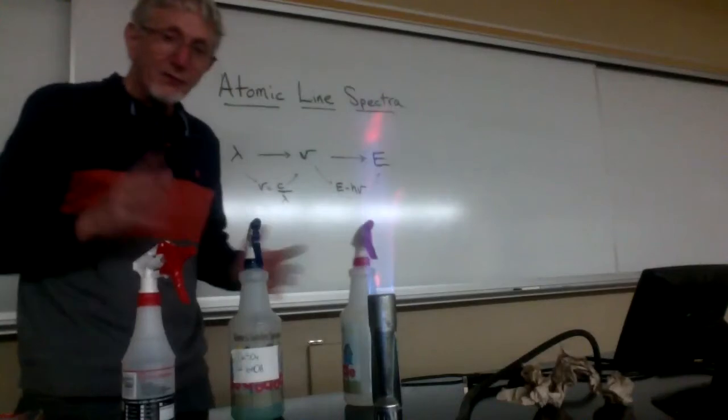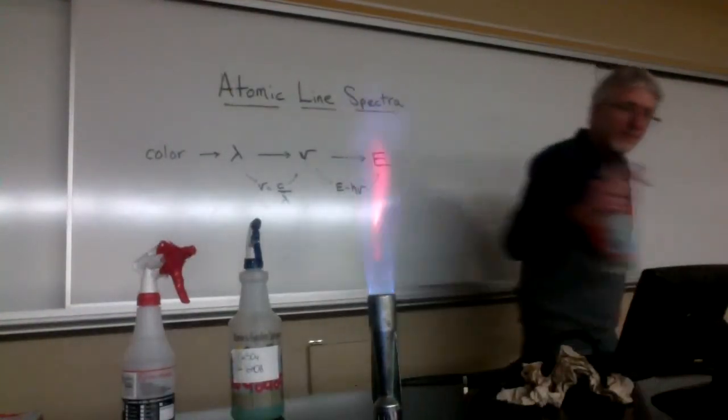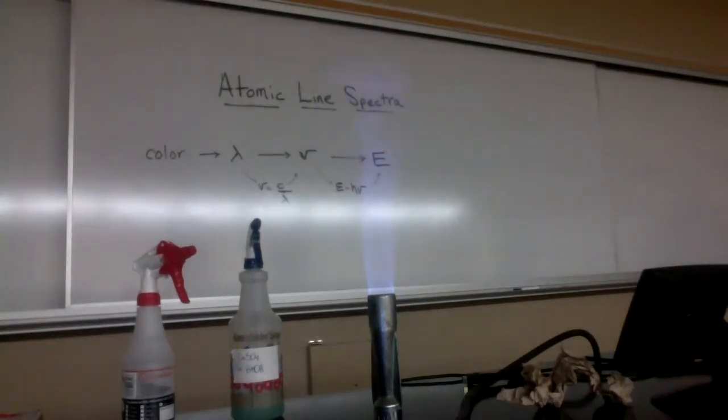I'm going to turn out the light and see if the colors are more distinct. I've got to be careful here because it's so dark. But here's, that's our strontium. And here is our copper. I don't know if the color looks any better.